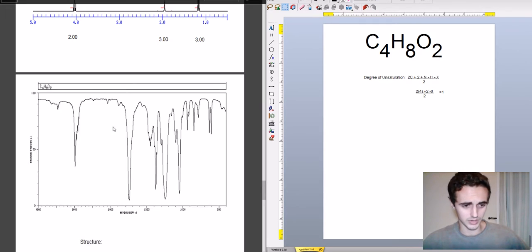Let's look at our other peaks that are above the 1500 mark. This is a C sp3 to an H, so don't worry too much about it. Those are very common peaks. Anything above here, no, we know there's going to be no alcohol functionality or carboxylic acid functionality, because there's no big, dipping, round dip here.